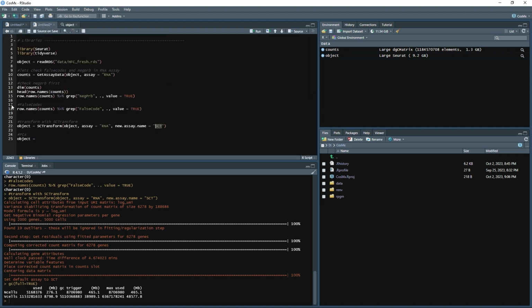It's up to you. It just, like I had said, it takes a lot of memory. The transformation there got up to 44 for the total R environment. I would recommend 64 for this particular assay, depending on how many genes that you have. If you have 1,000 genes, of course, you're not going to need that much. But as technology gets better and better, more and more genes are going to be included, and a cluster is something that would be very nice to have.